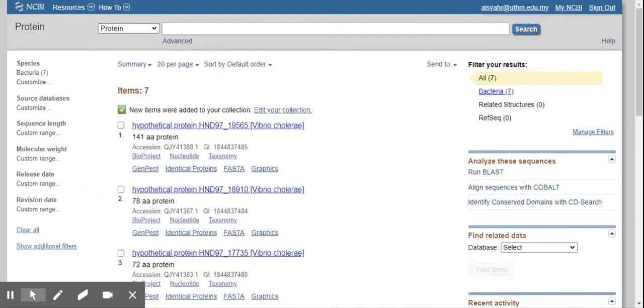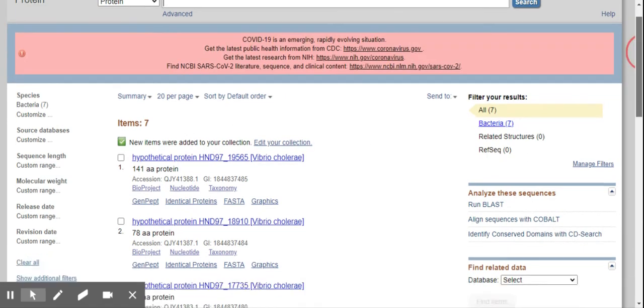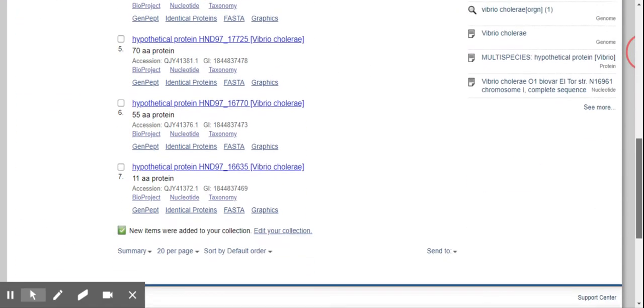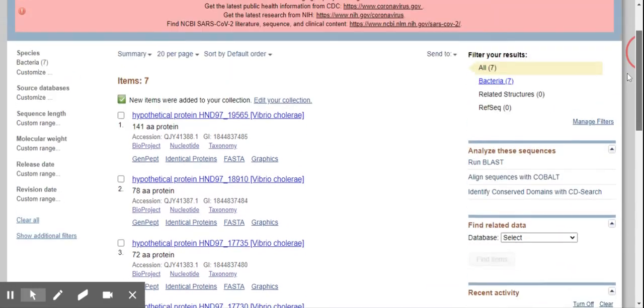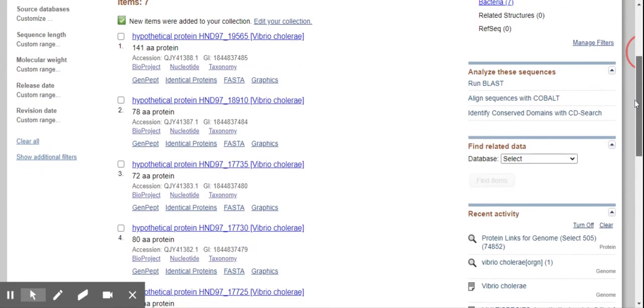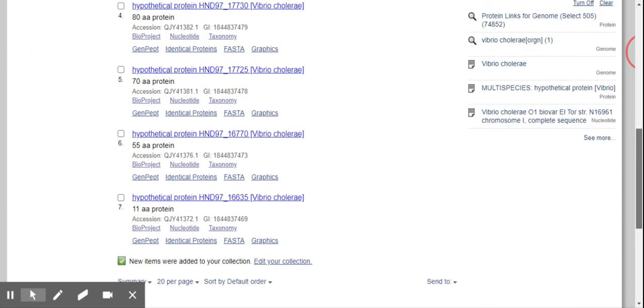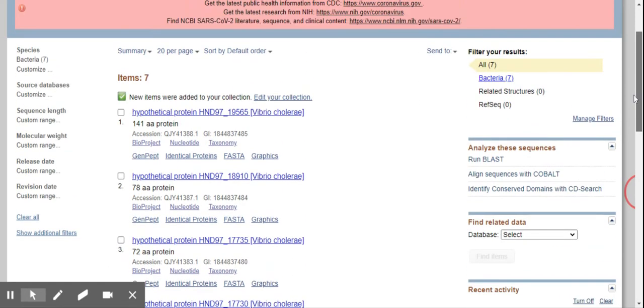So when I save this, I have all the hypothetical proteins here listed. Okay. So in this situation, you will have your hypothetical protein listed within this collection.